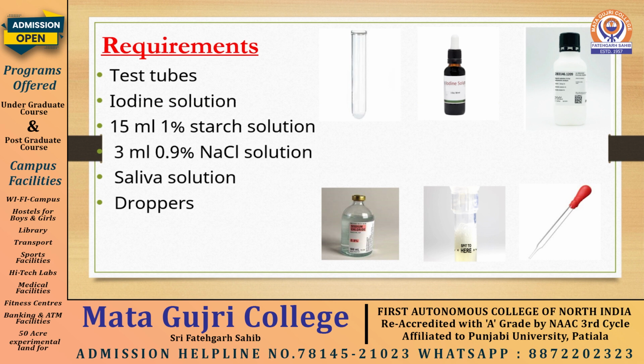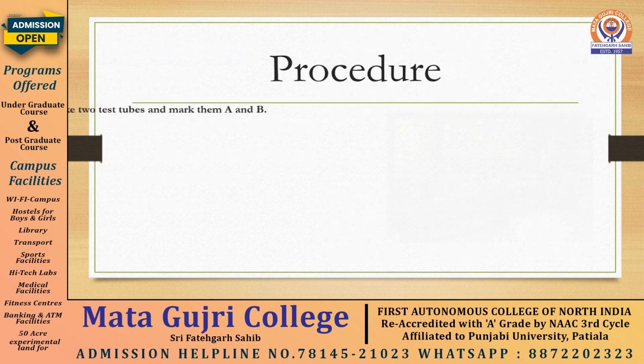If the same experiment we were supposed to perform in the laboratory, how would we do it? So for that we need certain requirements: test tubes, iodine solution, 15 milliliters of 1% starch solution, 3 milliliters of 0.9% sodium chloride solution, saliva and dropper.